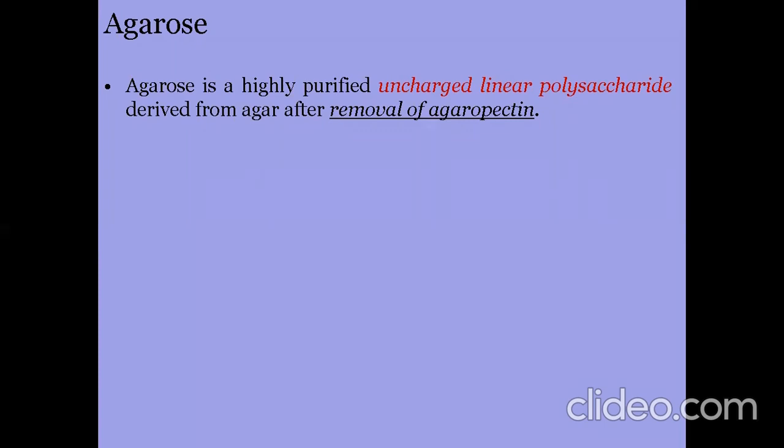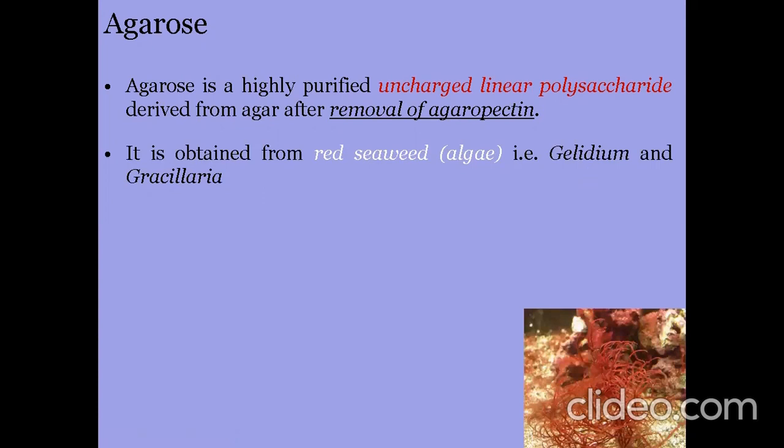And what actually agar is, it is obtained from red seaweed algae, Gelidium and Gracilaria. These are two different genera, and both are red seaweed.